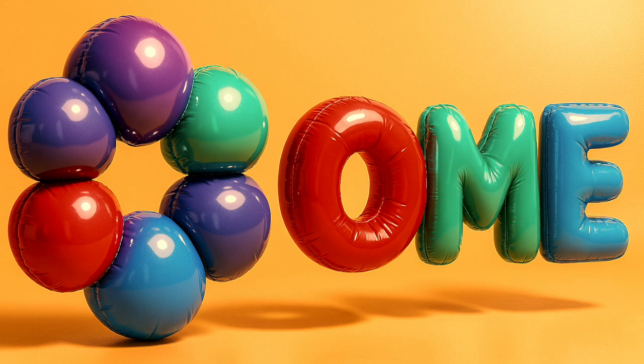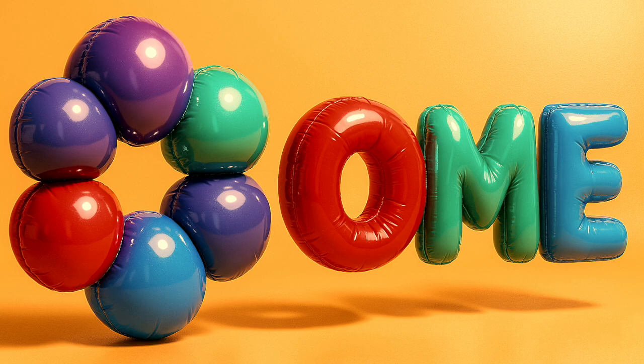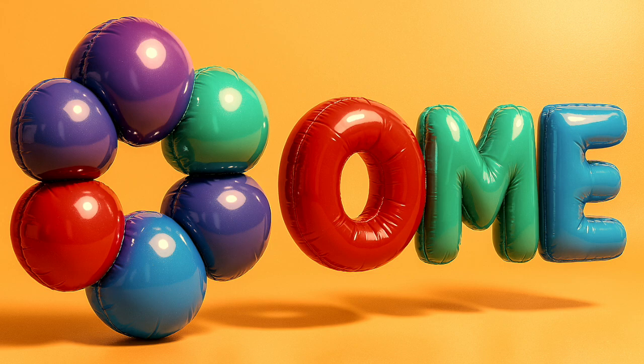So you've got these different silos based on the equipment. Right. So the vision for OMERO is it not only stores the image, but it knows it's, say, a Zeiss image. And then it could potentially offer to open that image directly in the correct Zeiss software for analysis. Oh, that's clever. Seamless integration. Yeah, it would really streamline the whole process, from finding the image in OMERO to actually working on it in this specialized tool. Like a central command center that connects you to the right tools automatically.